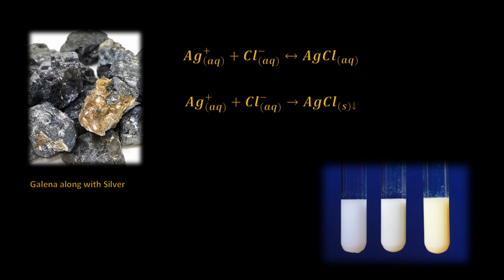Also note that a large excess of chlorine due to an excess of HCl being added can and will result in a soluble complex of silver dichloride. That is why diluted hydrochloric acid is used sparingly.